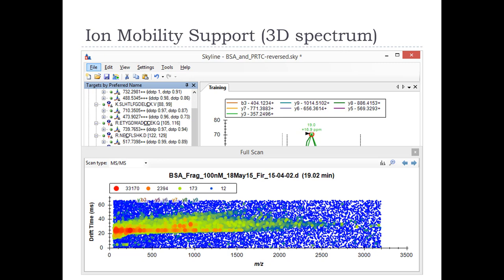This was collected with ion mobility. I showed you a 3-dimensional space before. This is actually a 4-dimensional space where we're collecting 3-dimensional spectra over time. So I can't even really show it to you, but every spectrum is 3 dimensions because it's got a drift time to it. And then you can see that what we think of as a spectrum is sort of this horizontal line here where you see a lot of red. That's clearly some precursor that's been fragmented.